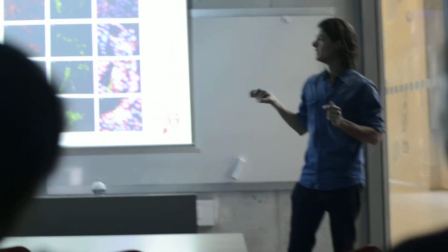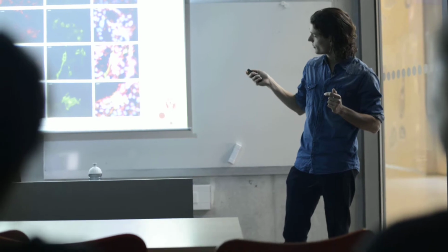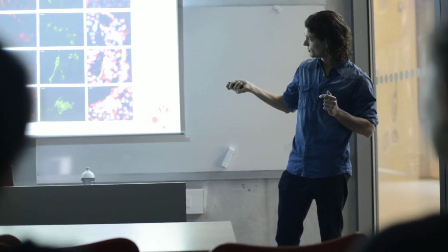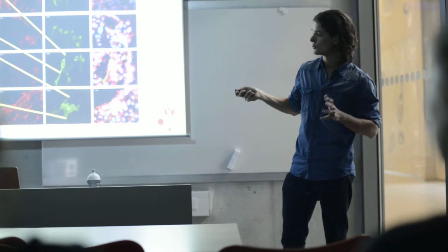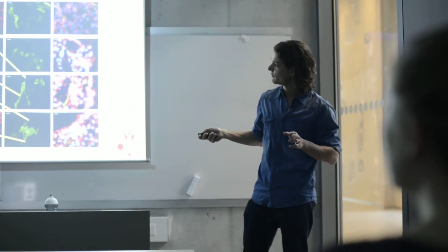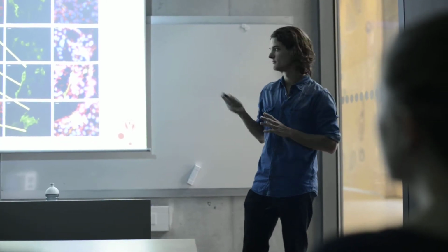Cytoplasm and nucleus. And the first three constructs localize primarily to the cytoplasm. And the final one, without the C-terminal tail, we can see, this is the zoom in of them. Without the C-terminal domain, we can see that the NBC1 construct does not localize properly to the plasma membrane. But once a full-length NBC1 is expressed, you get proper localization of NBC1.